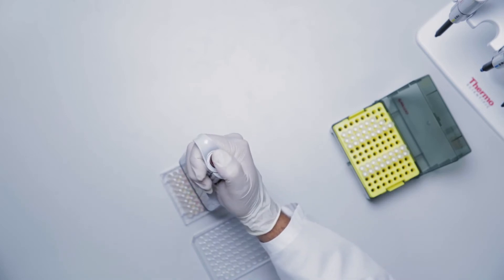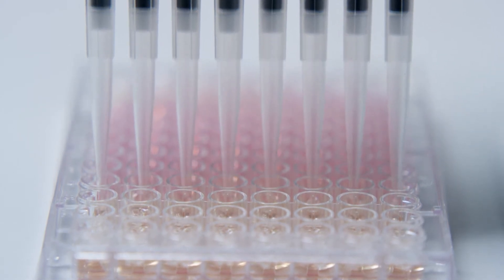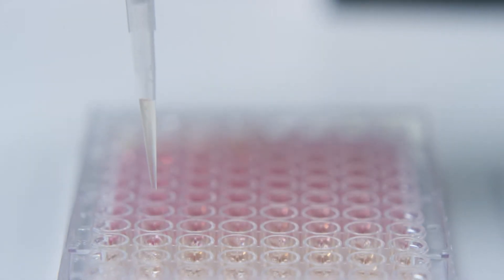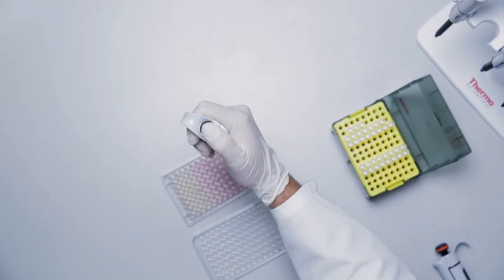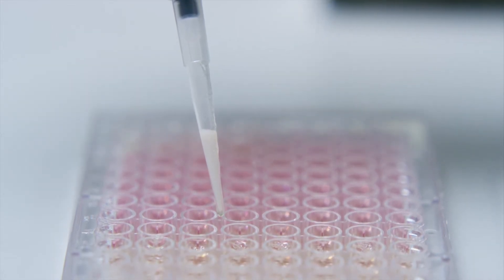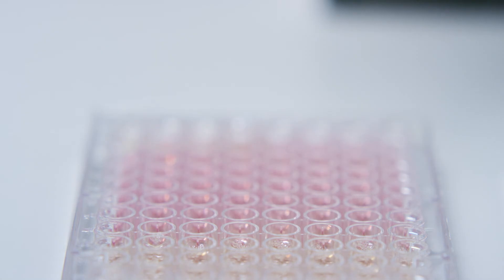After incubation, resuspend the contents of each well with a pipette 10 to 15 times and change tips. The cell lysate should be clear and non-viscous; the viscosity of the lysate should be similar to the viscosity of the lysis mixture. An incompletely lysed sample will appear highly viscous, requiring additional diluted lysis mixture or a longer period of lysis at 50 to 55 degrees Celsius. Use lysates immediately in a QuantaGene singleplex or QuantaGene plex assay, or store at negative 80 degrees Celsius for future use.